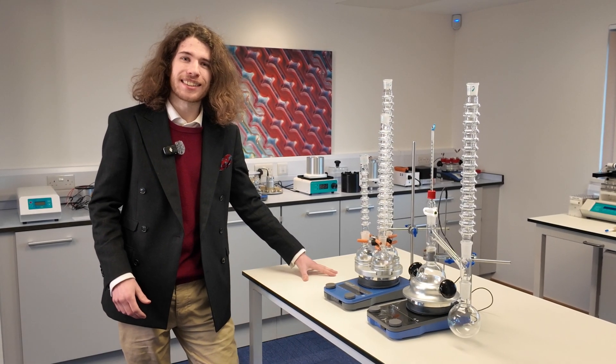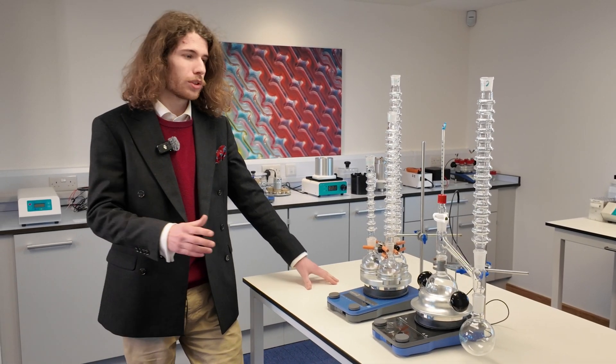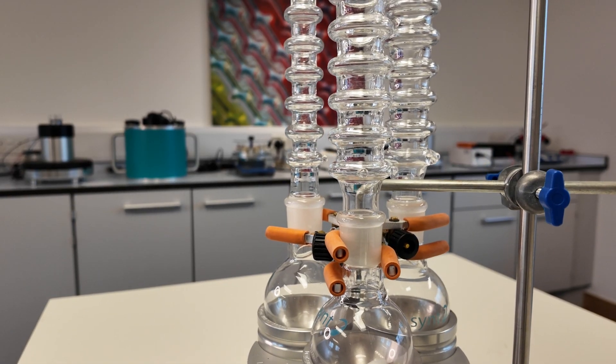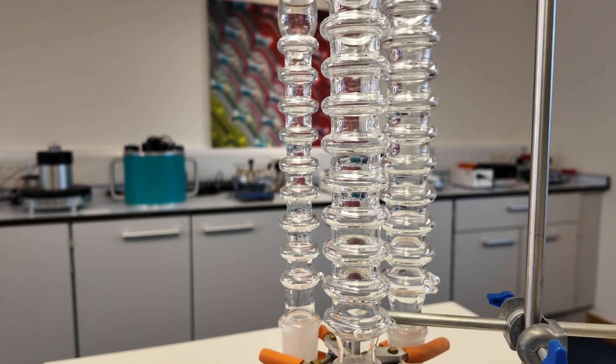Hi, I'm Cameron from ASYNT and in today's video we're going to be looking at our Condenser waterless condensers. The waterless condensers use only the shape of the glassware in order to condense. Despite the fact that they don't use any water, they are just as effective as Liebig condensers.